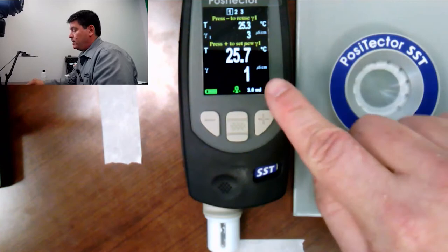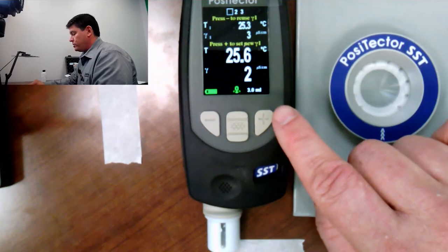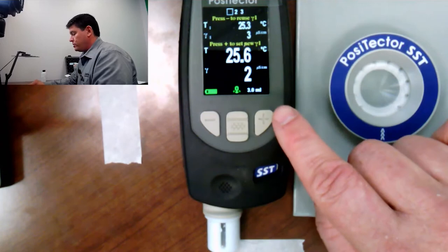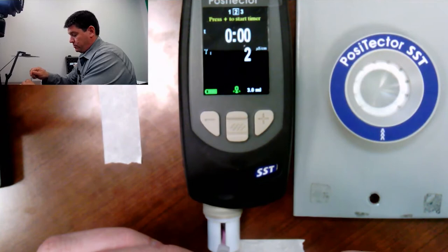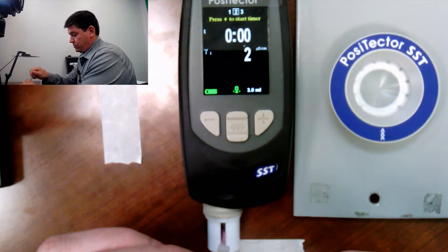The PosiTector SST works on a one, two, three step process. The first step is to determine what the background conductivity of my testing solution is, because even though it's deionized water, it's going to have a conductivity to it. So the first step: we take some of the solution and we place it into the test chamber. You'll see my zero changed to a one, and now to a two. So the background conductivity of my solution is two microsiemens per centimeter. Once that number is stabilized, I push the plus button and I've now jumped to step two. It has saved my background concentration of two. I'm going to extract this solution back out, and now we're going to insert it into the PosiPatch.